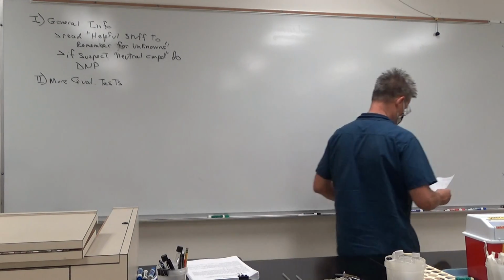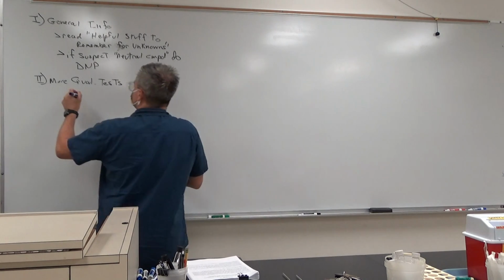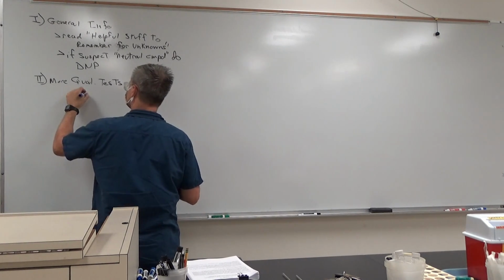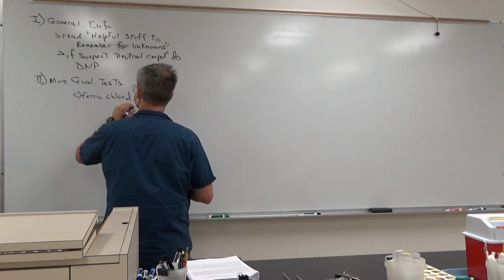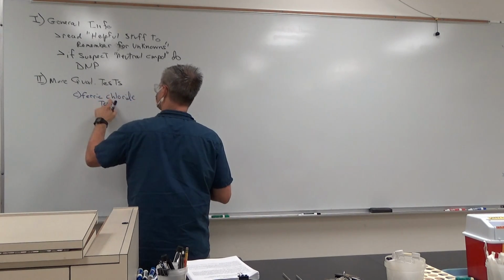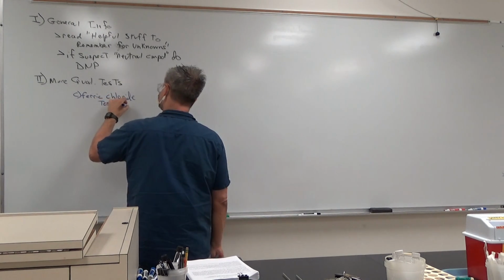All right. Ferric chloride test. Okay. Test for phenols.